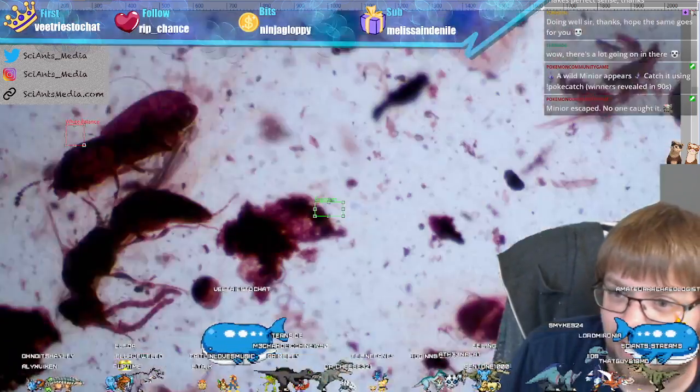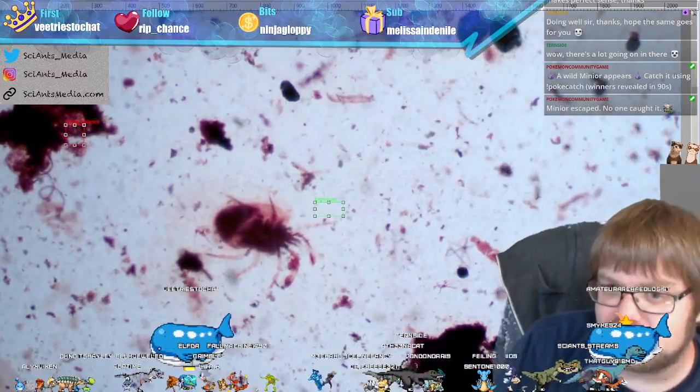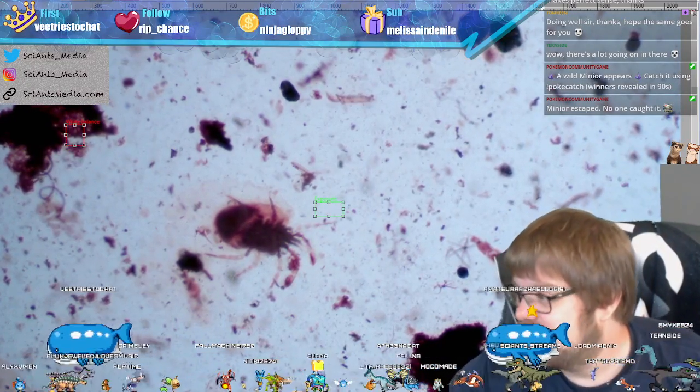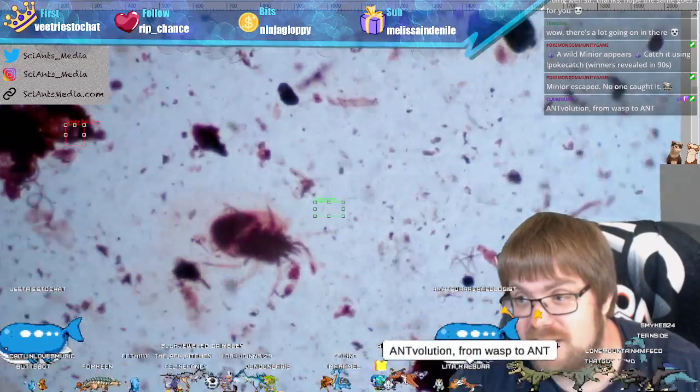If we go over here, there's a mite. It's not clear if this is a parasitic mite or a food mite, but you can see it has a whole bunch of structure that you can see.